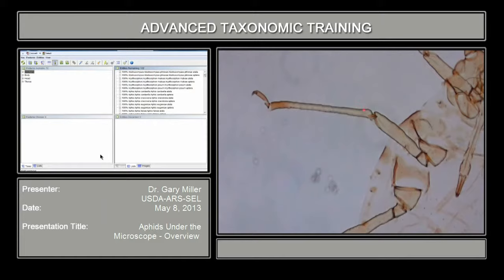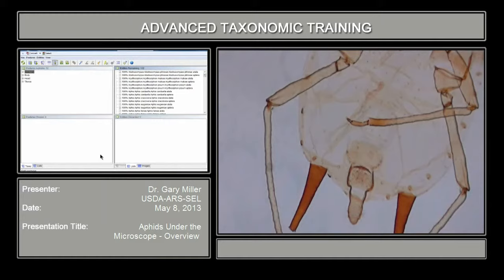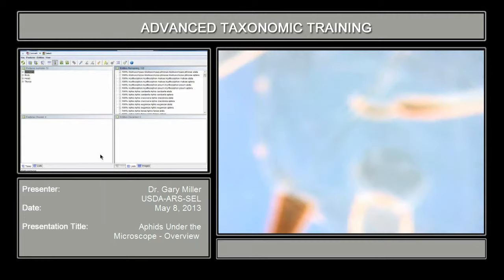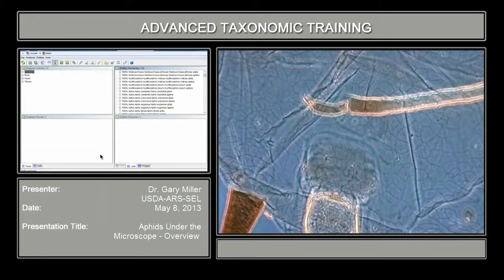In some keys, some of the couplets call for the amount of pigmentation that may occur on a specimen. Sometimes the abdomen has reticulated patterns, and that's sometimes diagnostic. You can see the reticulation nicely over that entire specimen.